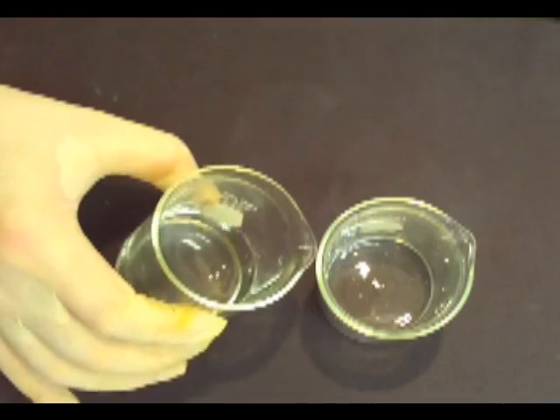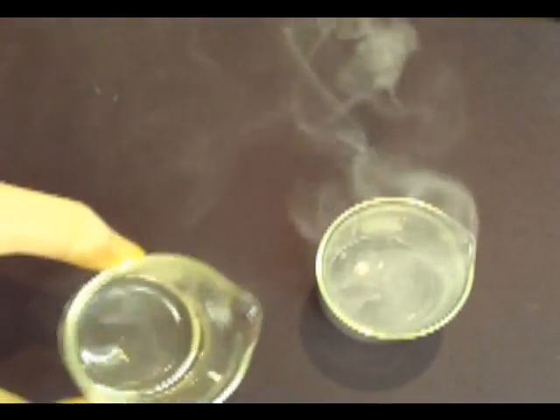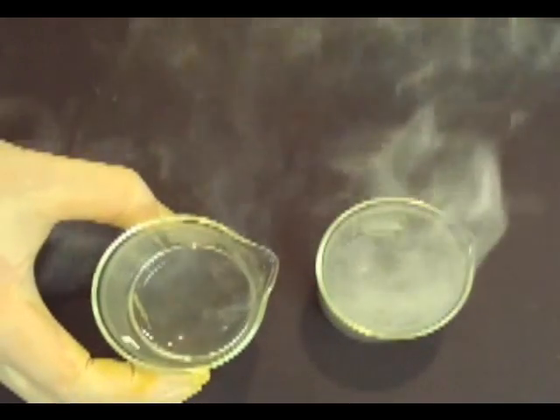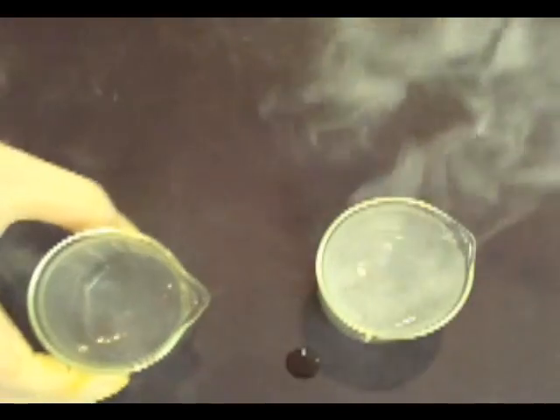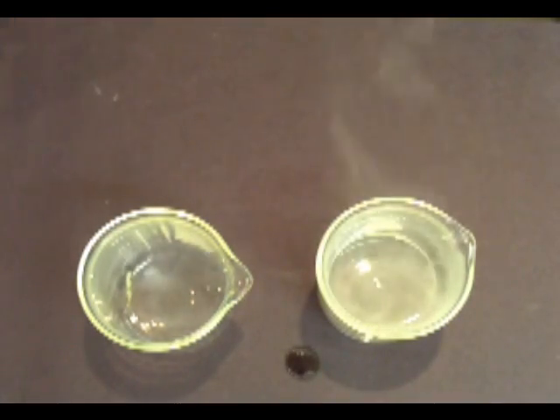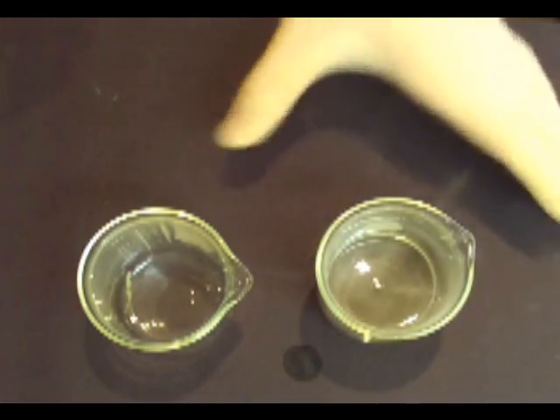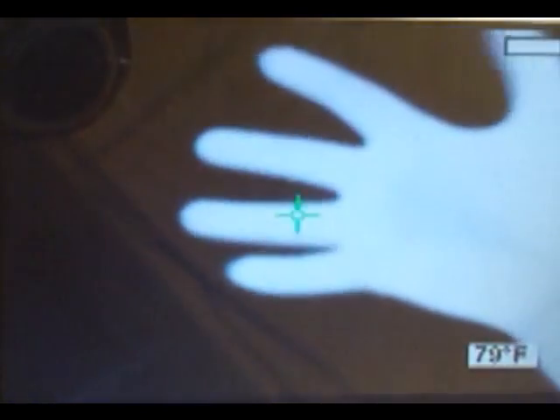If you mix them together slowly, you'll get even more smoke and the reaction begins. As you add more, the temperature of the mixture begins to rise quickly. The rise in temperature makes the rate of the reaction faster, which in turn creates more heat. In a few seconds this beaker will be too hot to touch. Given high enough concentration it can even start to boil. So this is our first clue that we have an exothermic reaction — though just saying that on video does not really mean much.